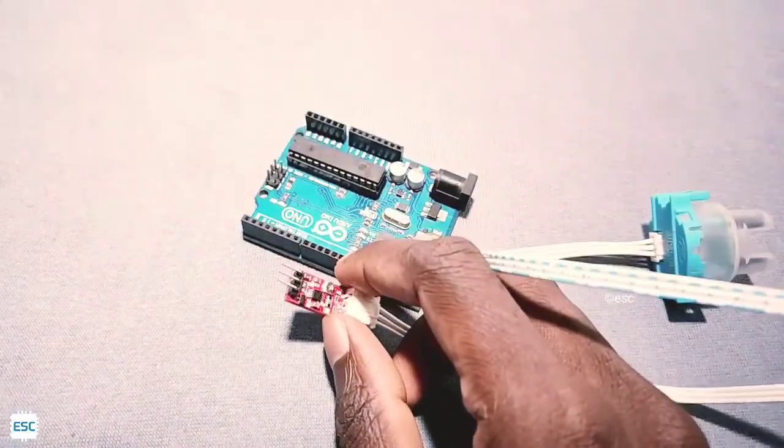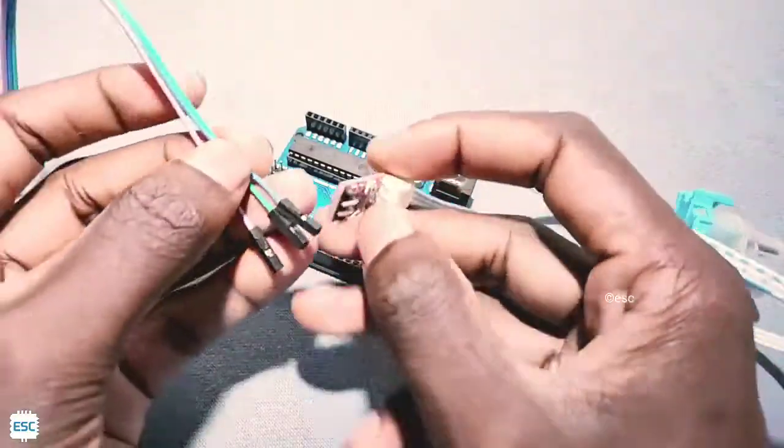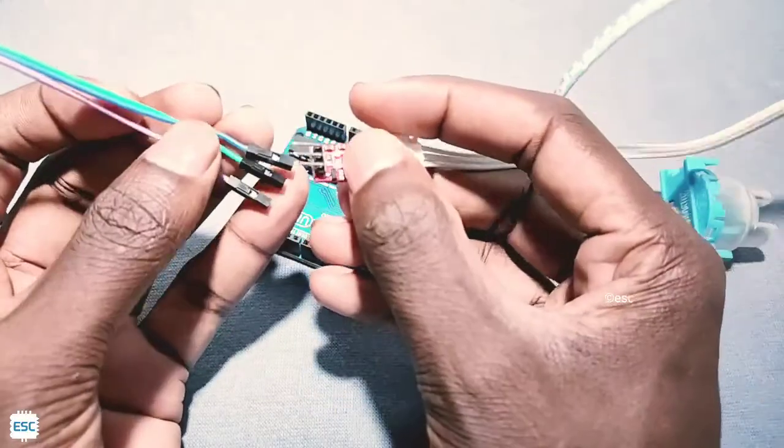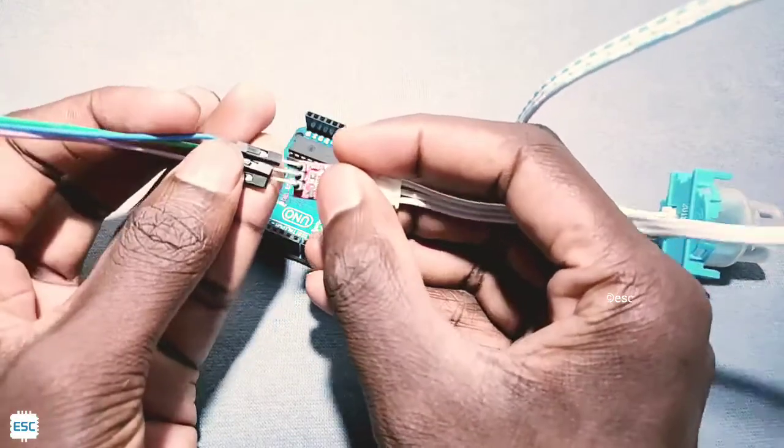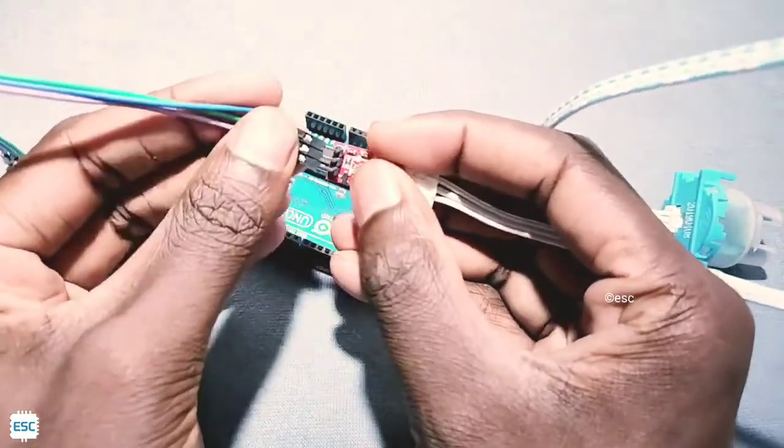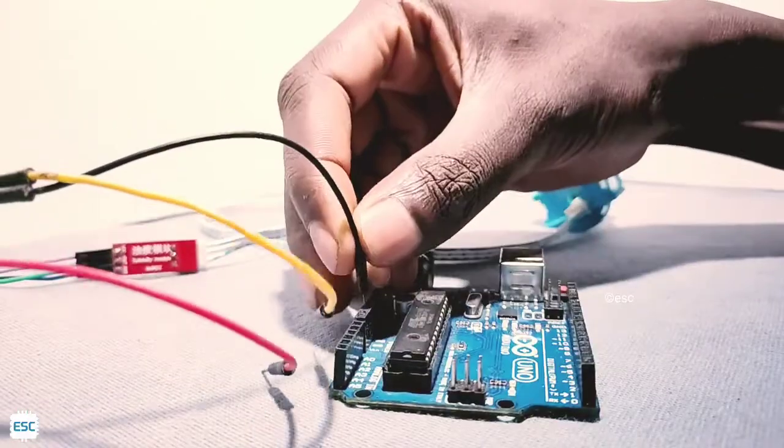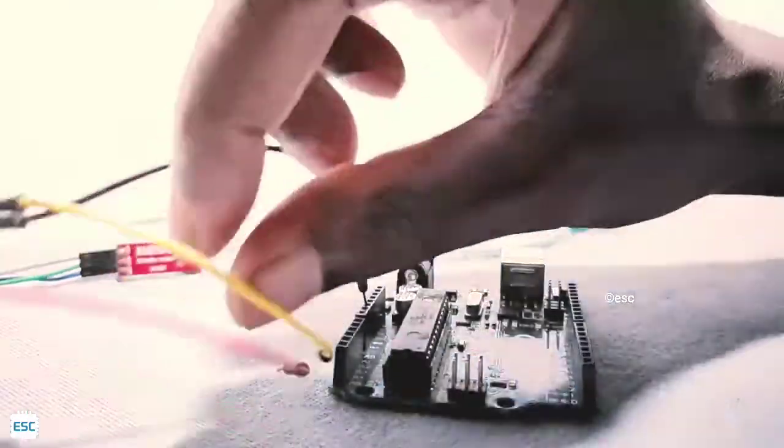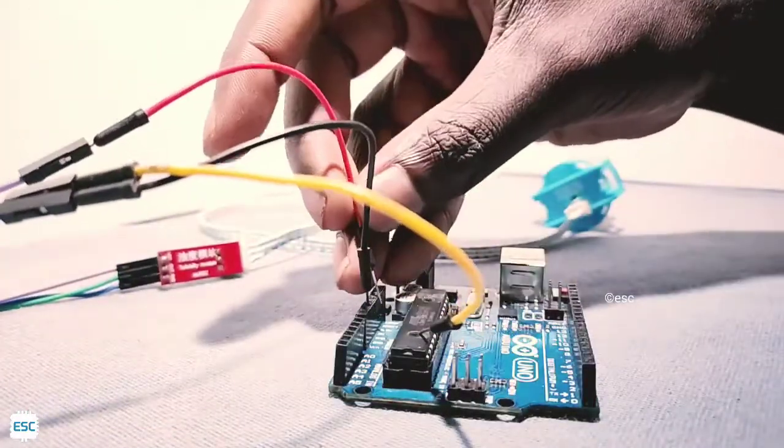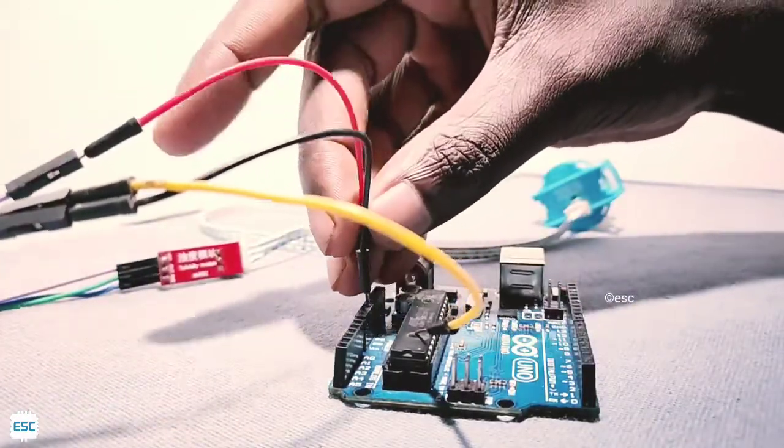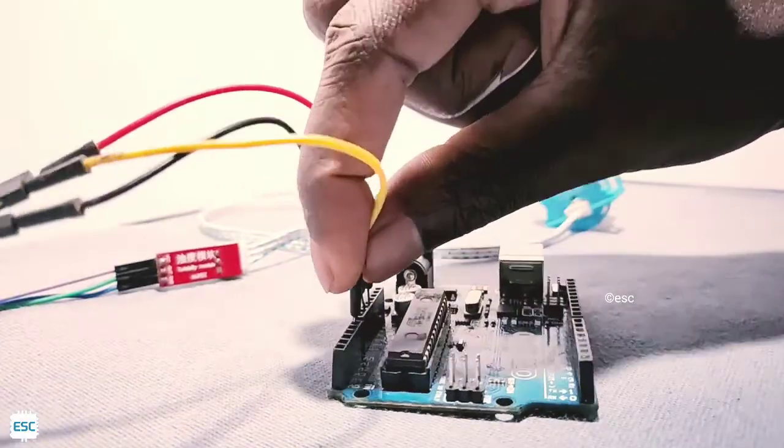A turbidity sensor has three pins: ground, VCC and analog output. First connect ground to ground, then VCC to 5V and the analog out to A0 pin. And now let's check the values.